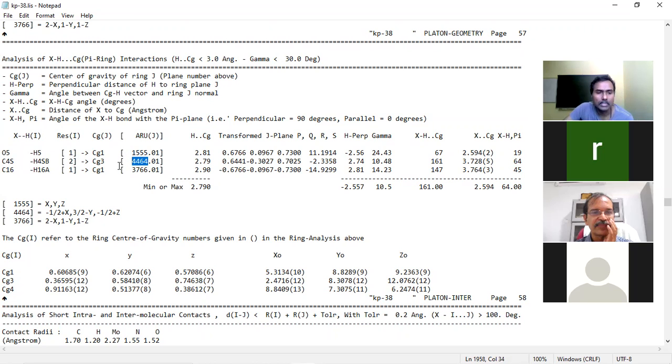Sir, is there any other way we can represent pi-pi interactions? Because I saw in some other papers, pi-pi interactions are represented in other ways also. Is there any other, or only two types? Can you just explain what you have asked? Sir, we just now discussed two types. One is the line and another is polyhedra. Two ways of drawing. Yes, you are asking whether there are any other different ways to show it? Yes, sir. Maybe, but I don't know.